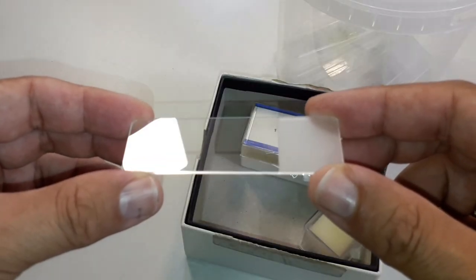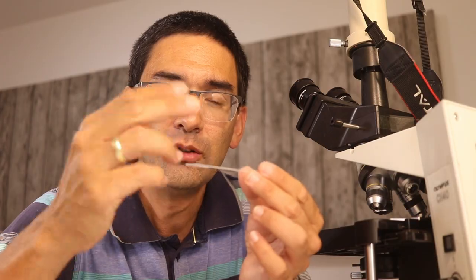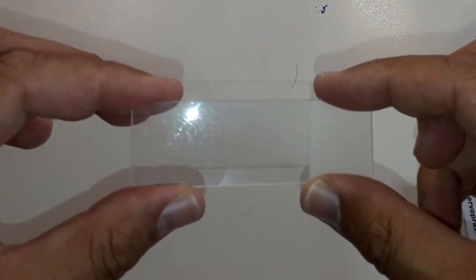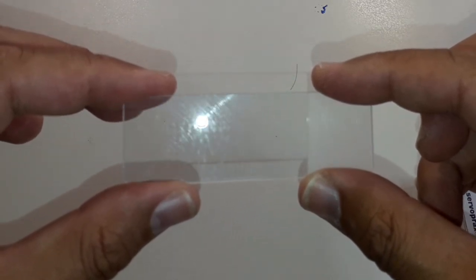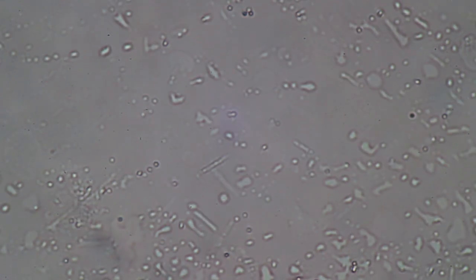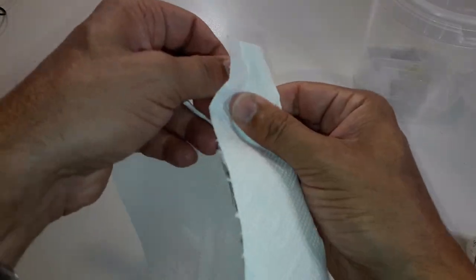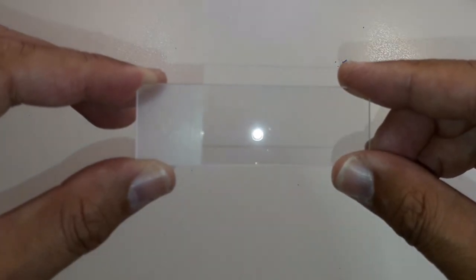One thing you might not know is that you should also clean slides before use. When you have a new pack of microscope slides you automatically assume they're clean, but they can actually be quite dirty. If you hold a slide against the light and look at the reflection, you can see there is a lot of grease from the manufacturing process still on there. Right now this is how a new microscope slide looks under the microscope — there is so much stuff on there that it really disturbs the image quality. It might also not be good for specimens, especially if you're observing water samples and there's some industrial lubricant on the slide. So I dry wipe new slides before use and that works perfectly fine.